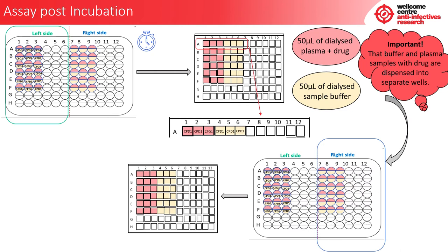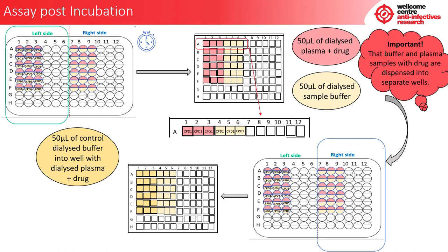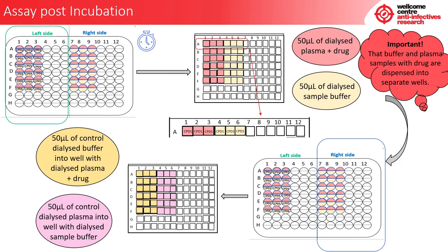Now we are going to look at the right-hand control side of the dialysis block. Into our 96-well 2 ml block, which already contains our dialyzed plasma and drug samples and our dialyzed buffer samples, we are now going to add 50 microlitres of control dialyzed buffer into the wells with the dialyzed plasma and drug (columns 1 to 3). We are then going to add 50 microlitres of control dialyzed plasma into the wells with the dialyzed buffer samples (columns 4 to 6). This is carried out to normalise the samples and reduce any ion suppression that may be seen on the mass spectrometer.